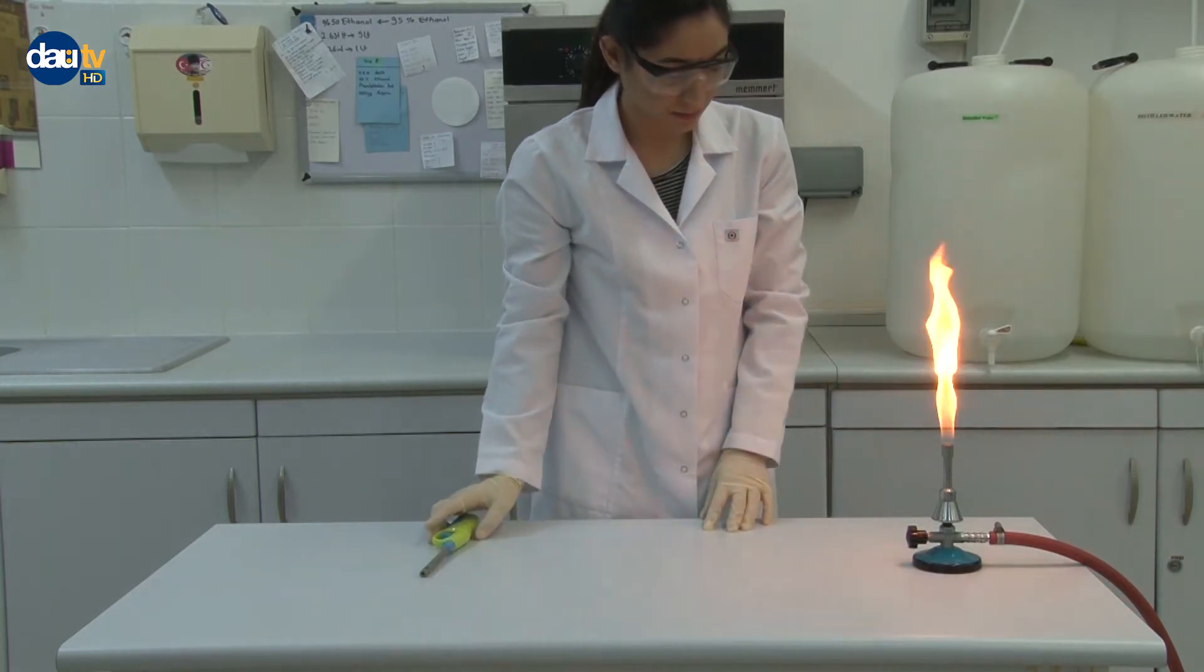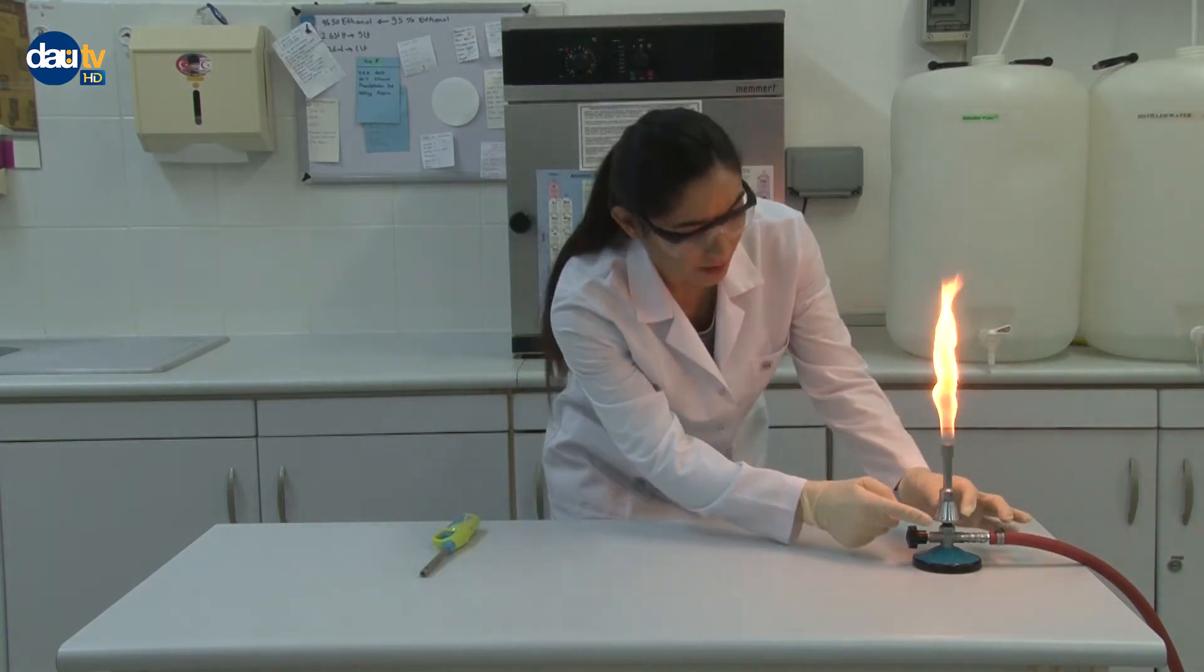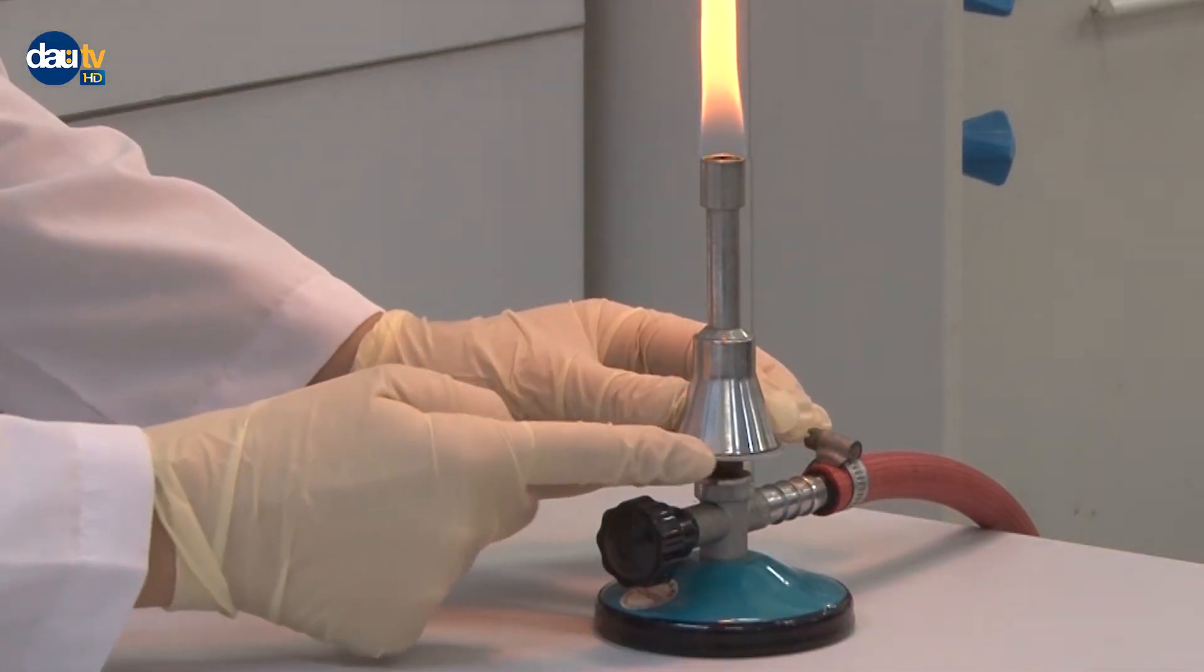Supply by opening the valve on the side of the burner where rubber tubing is attached. Notice that gas burns with a yellow flame.